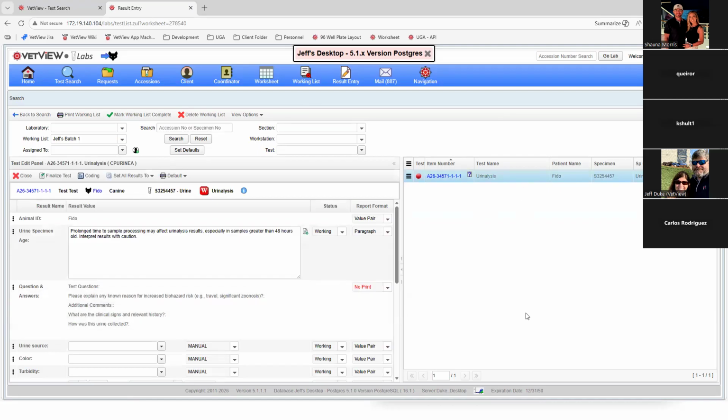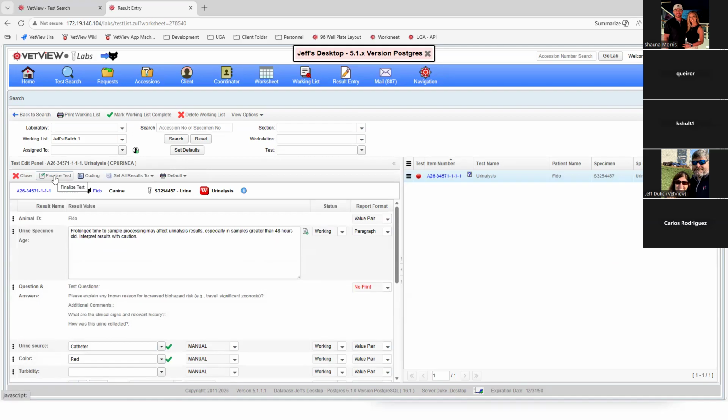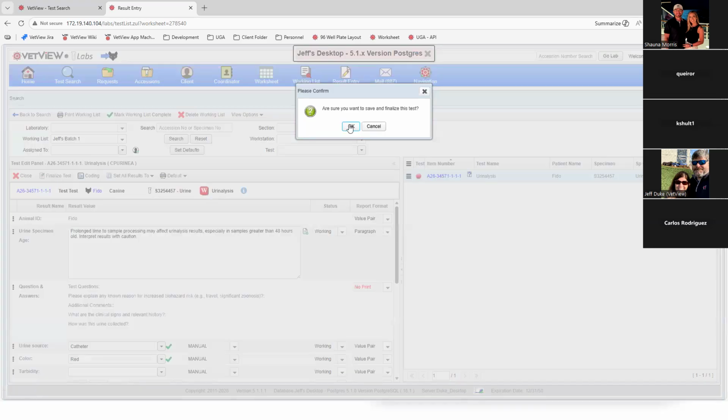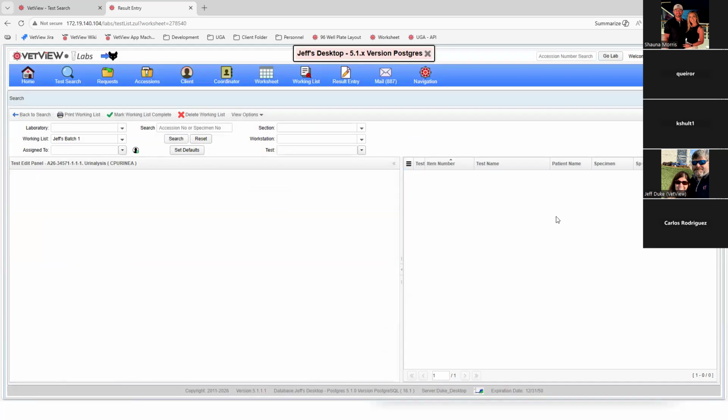I would just get the list of those over here where I could then work on it, doing my dipstick on here, fill in my results. So whatever the answers might be. Once I'm done, I can save those results. I can finalize the test from here. And when I finalize the test, it will mark it as final and then it falls off my list. So it's a way of grabbing up a batch of tests, working through those tests, finalizing each one of those as I do. Again, I like it for tests that you have to do individually anyways. Your urinalysis dipsticks, diffs, things that you're going to have to work through one by one anyways. Just your way to batch it up.